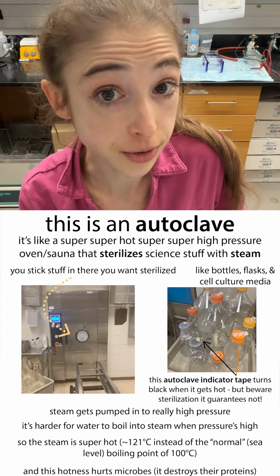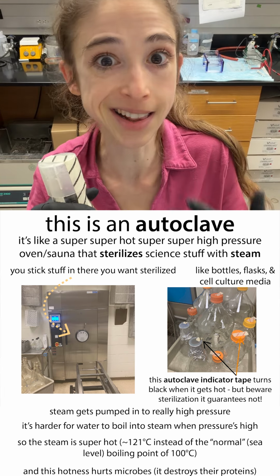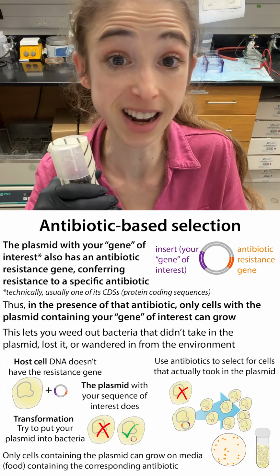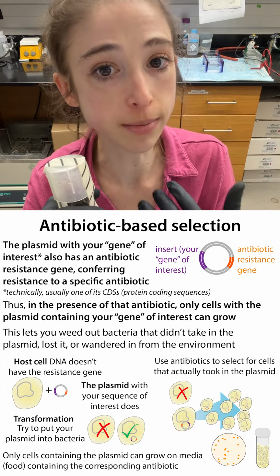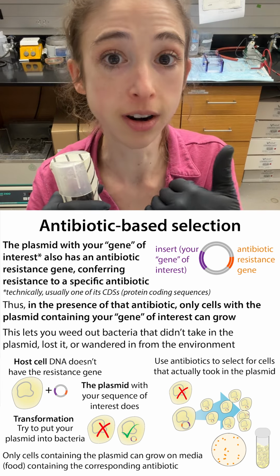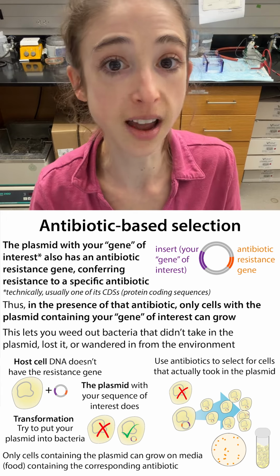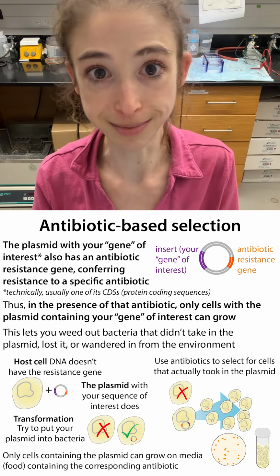It's also important, though, that you don't add your antibiotic before you autoclave things, because then the antibiotic is just going to go poof. And the antibiotic is going to kind of go bad over time in the media, and so you want to add it fresh to the media right before you add your bacterial sample, and then you don't want it to overgrow, or else the antibiotic goes bad and the bacteria can go bad.